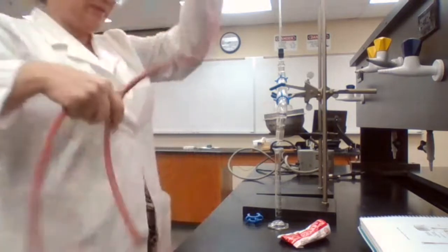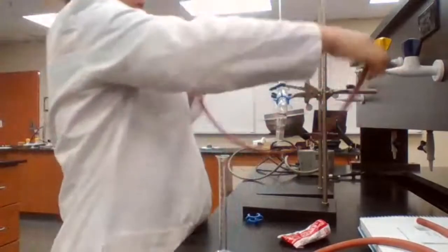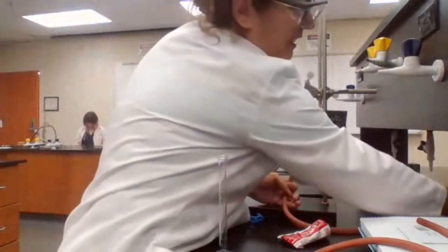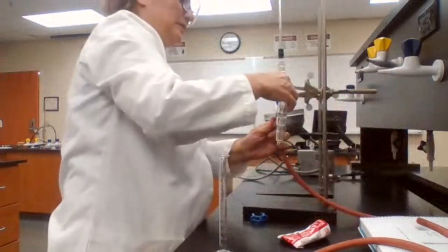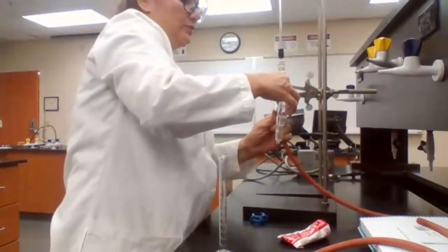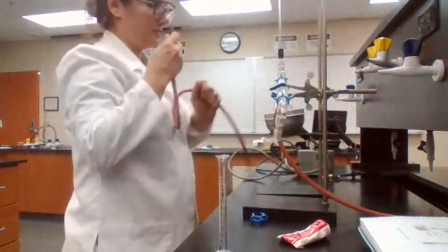The last part is connecting the condenser to the water hose to have a gentle flow of water in the condenser. The water should be going in from the lower end and out from the upper end of the condenser.